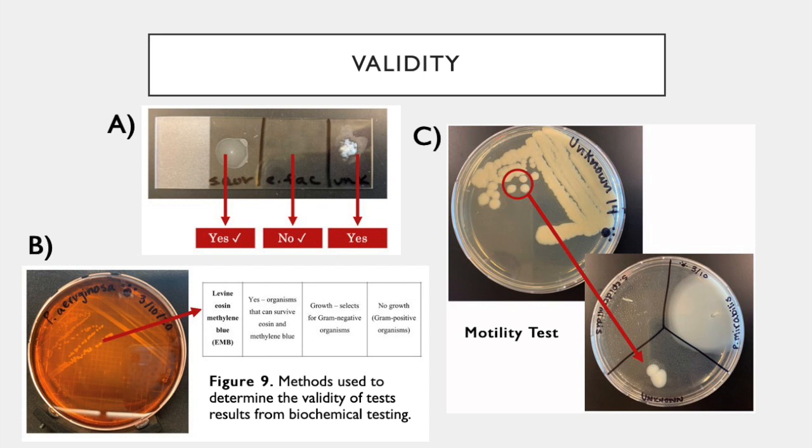This method is shown in Figure 9a. Once the tests were considered valid, then we researched the interpretation of the data, such as shown in Figure 9b, while looking at our lab manual charts.